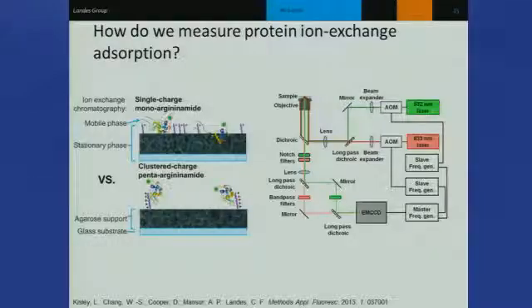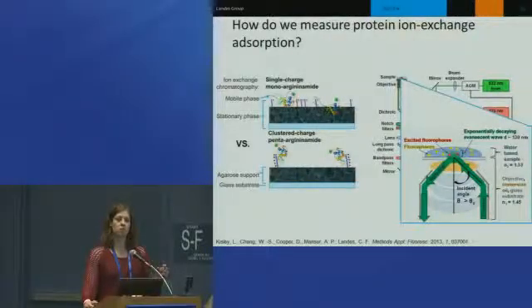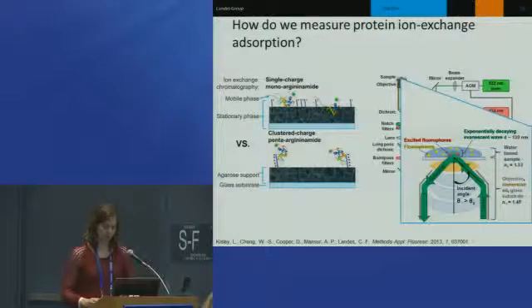And how we're going to do the experiment is on what ordinarily would be a traditional wide-field microscope in which you use the objective to do total internal reflection. And the reason that we do that is that when you use total internal reflection wide-field excitation, the evanescent field that's caused by the laser only goes about 100 nanometers into the sample. And so that means if you're interested in the interface between the mobile phase and the stationary phase, you only see that interface and nothing else. This is really low background measurement.